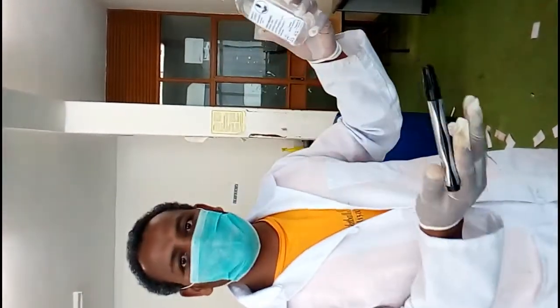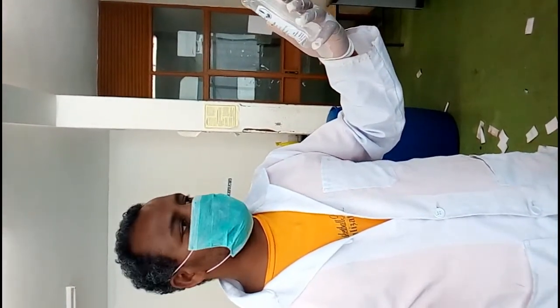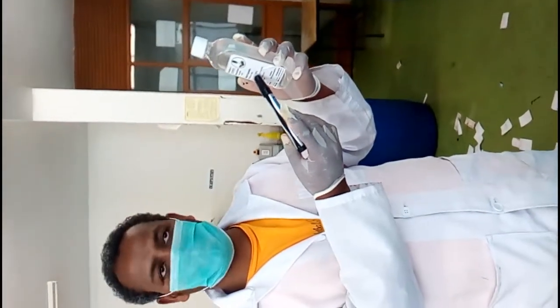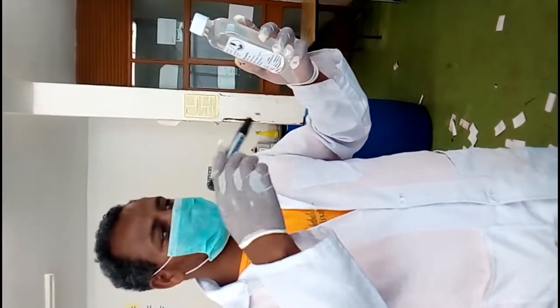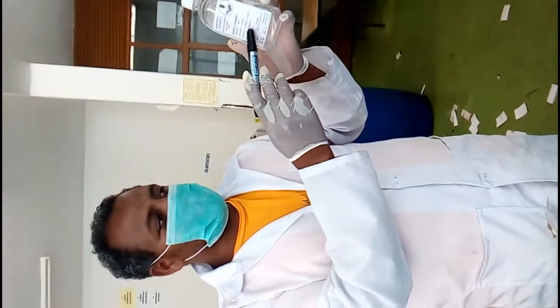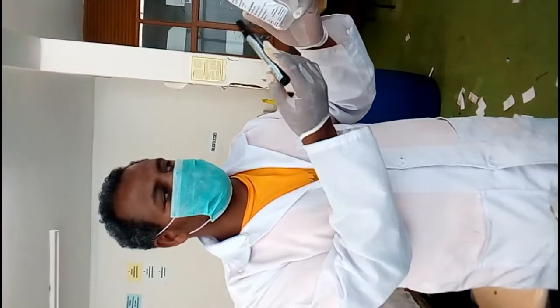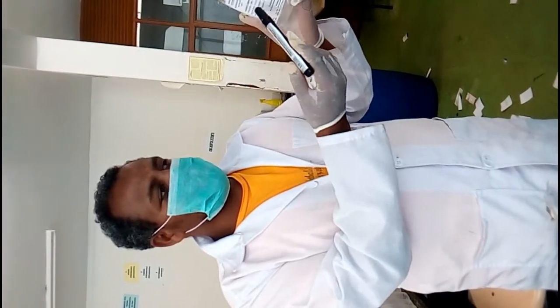Here, this percent comes, as we discussed before, from dilution. C1V1 is equal to C2V2. We can differentiate the amount of ethanol that is present in 1000 ml. We can calculate by that mechanism, and the percent of each ingredient or raw material used for hand sanitizer preparation is labeled here.